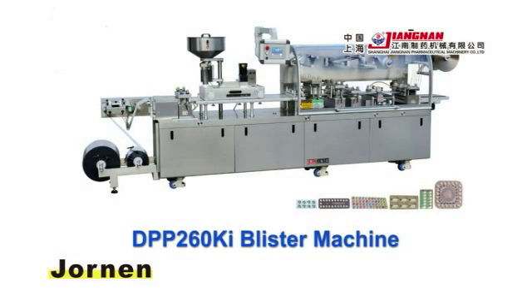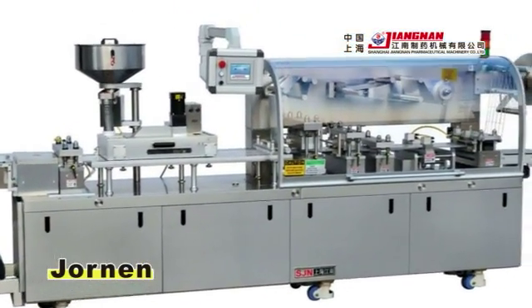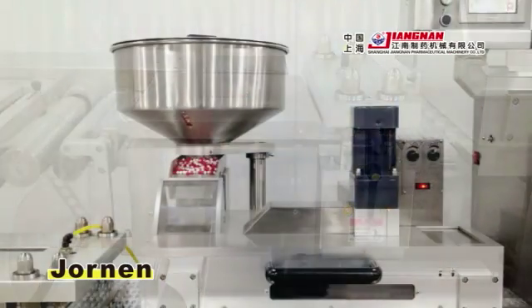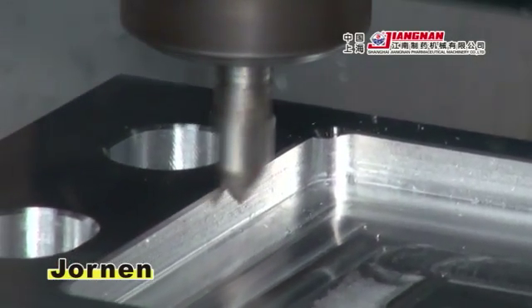DPP 260KI Blister Machine. The pursuit of detail perfection is evident throughout the design and production process. All the main parts are made of premium stainless steel and aluminum alloy material and machined by advanced high-precision CNC tooling machines.